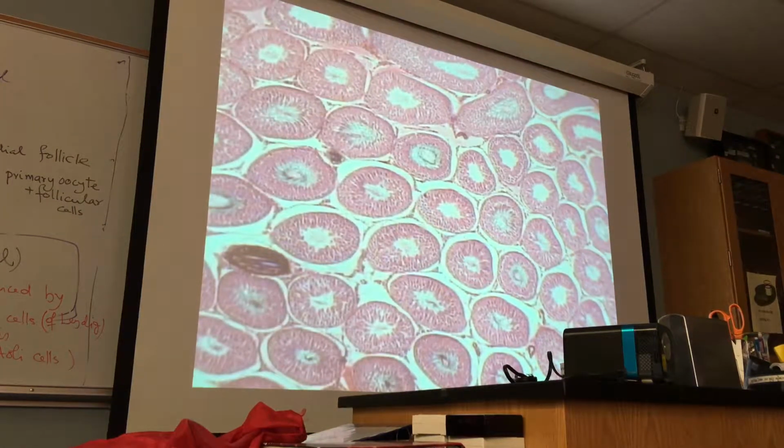Testis. Showing, what are those tubules called? Seminiferous tubules. These are the structures that produce sperm cells.